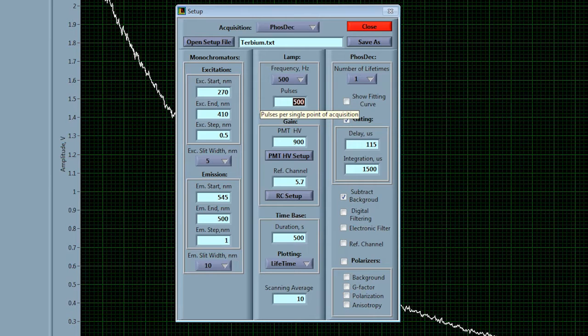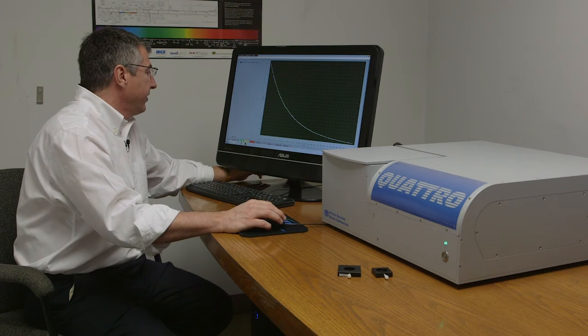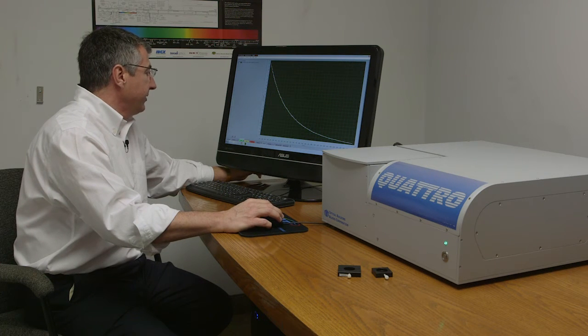However, if we go back to the setup panel we can actually, for a number of pulses, just choose only one pulse. What we're saying is we only want to flash the lamp once. We want to collect the entire decay curve that results from that one single microsecond flash.